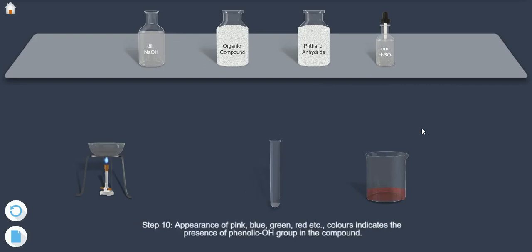Step 10: Appearance of pink, blue, green, red, etc. colors indicates the presence of phenolic OH group in the compound.